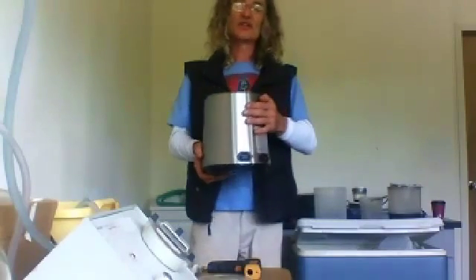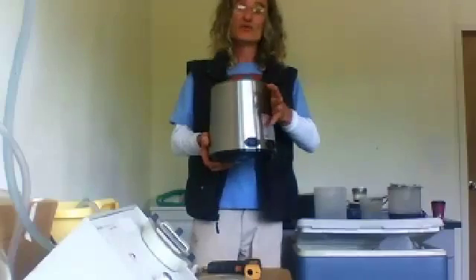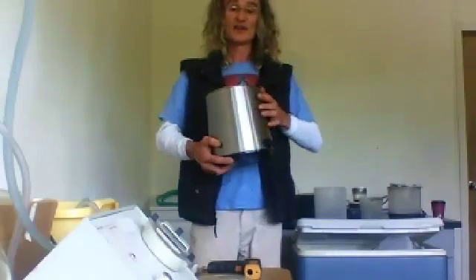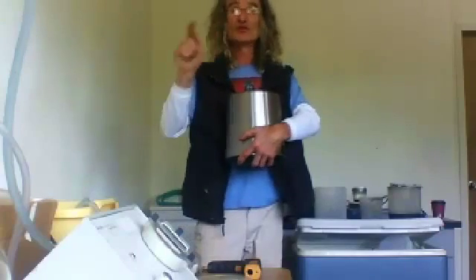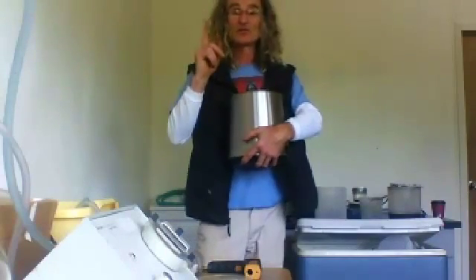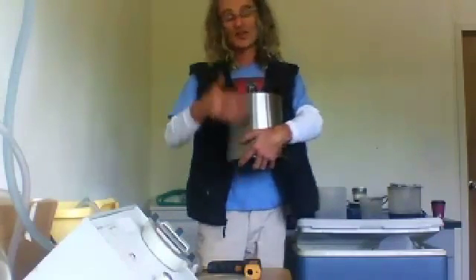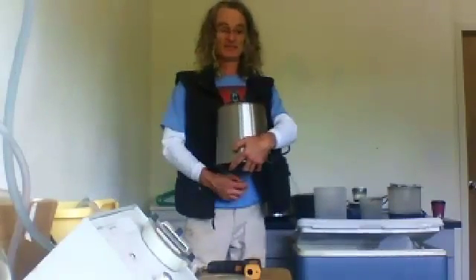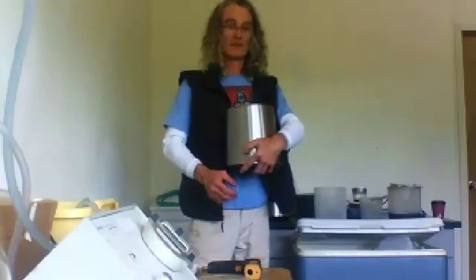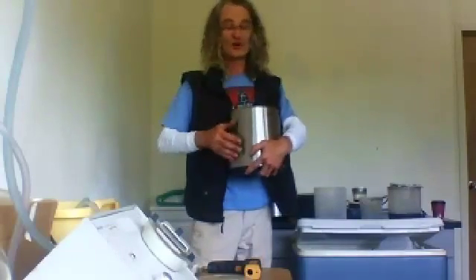And then slowly start it up again. And now I'm removing a very fine part of the alcohol, because the faster you run this, you're going to remove the terpenes that are in here. And there's one terpene you don't want to remove. Actually, all the terpenes you don't want to remove, is alpha-pinene. That's Alzheimer's. Alpha-pinene. You do not want to remove this sucker.